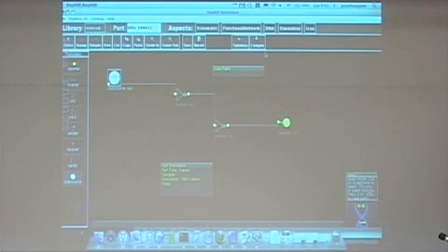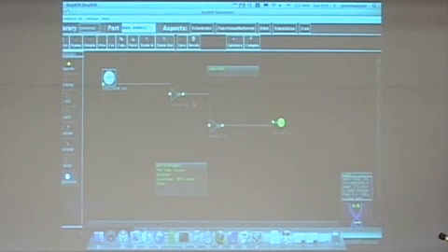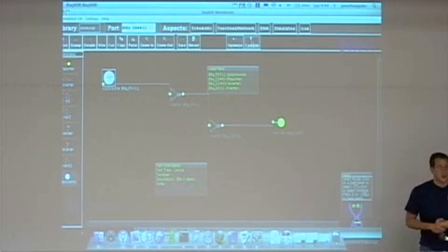The cool feature of BioJade is that you can push this compile button. Now, there's no information that you put here at all as to how this design is going to be implemented. If you push the compile button, what BioJade does is it goes to the parts database, and for each of these types of part prototypes, it grabs a list of parts that could possibly implement that prototype, and it figures out which ones are compatible based on signal levels, should you have that data, and also based on incompatibilities.